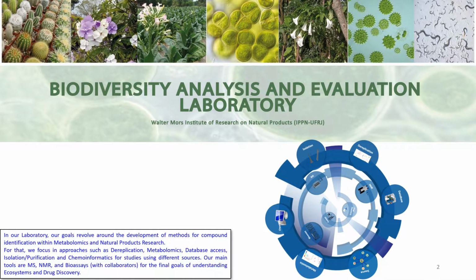In our laboratory, our goals revolve around the development of methods for compound identification within metabolomics and natural product research. For that, we focus on approaches such as dereplication, metabolomics, database access, isolation and purification, and cheminformatics for studies using different sources. Our main tools are mass spec, NMR, and bioassays, this last one with collaborators, for the final goal of understanding ecosystems and drug discovery.